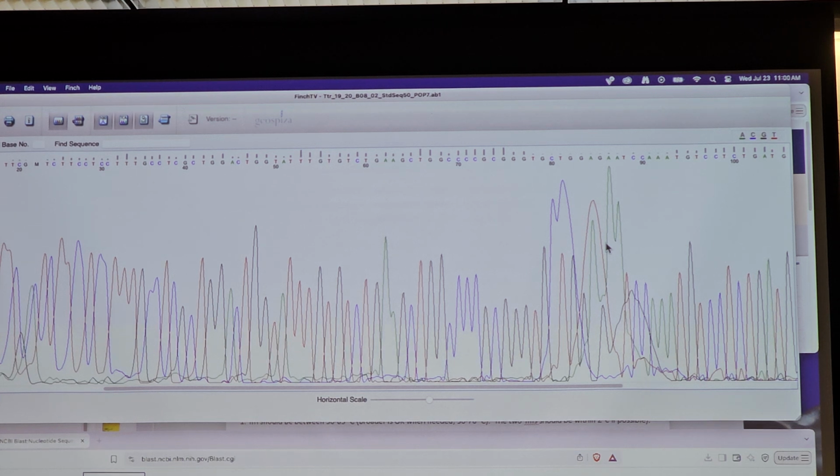If we were going to publish the sequence, that would be a different story. But the transthyretin sequence is already published, already known, no need for you to publish it, right? You were doing a gene study. What happens if there is a mismatch between the forward and reverse?